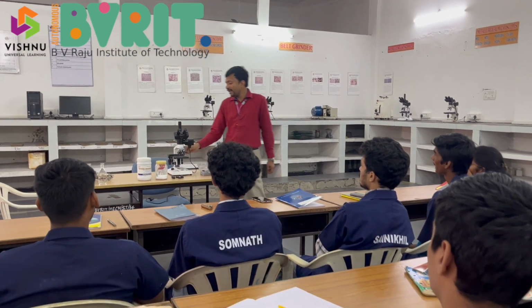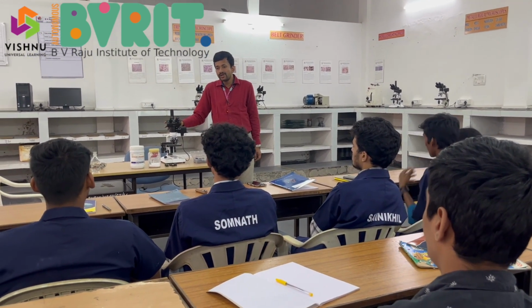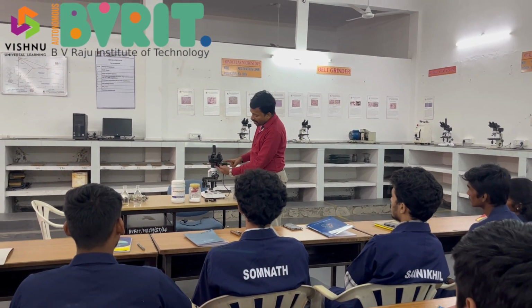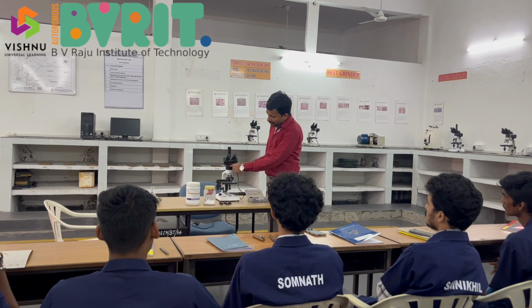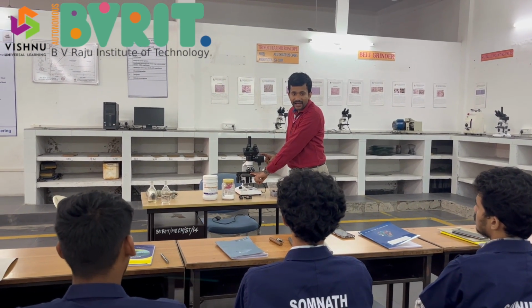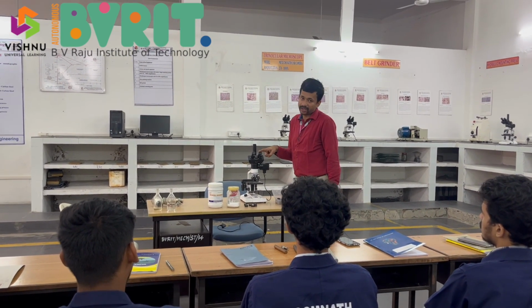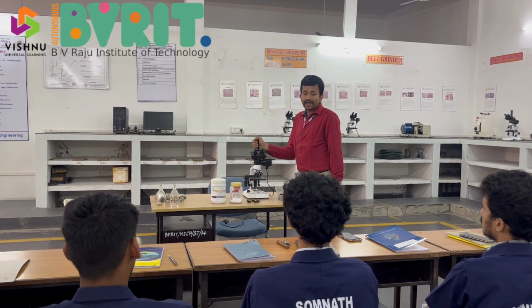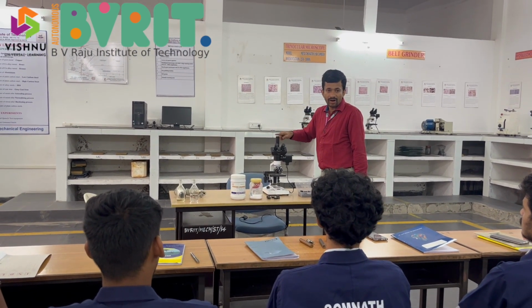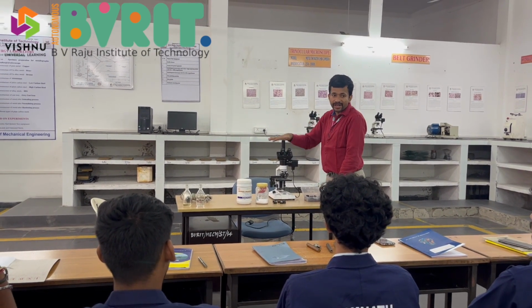So there is a working principle for this microscope. In the working principle, you have a light source here, and then you have a pair of prisms which will direct it onto the workpiece or the specimen, and then it will be reflected back, and then you can view it under the microscope. By the way, this is a trinocular microscope where you can also have a camera attachment on the top and two binoculars. That's why it is called trinocular.